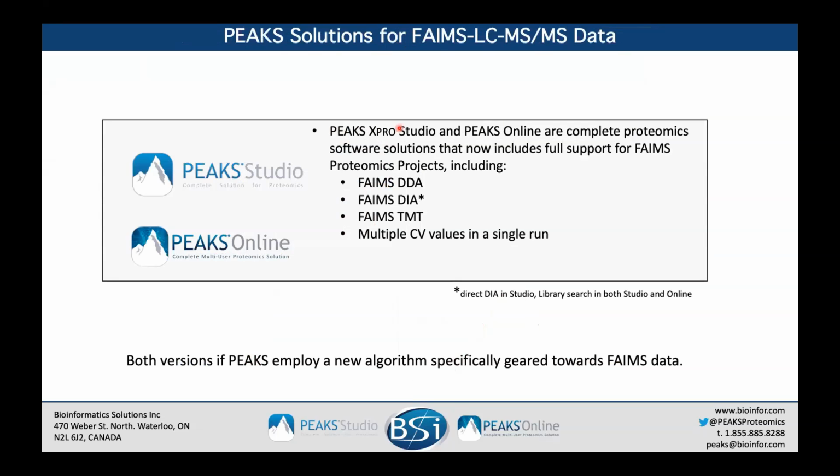And so for FAIMS, we now offer a complete solution. This really applies to DDA, DIA, TMT, and direct DIA in Studio, and can include multiple CV values in a single run.